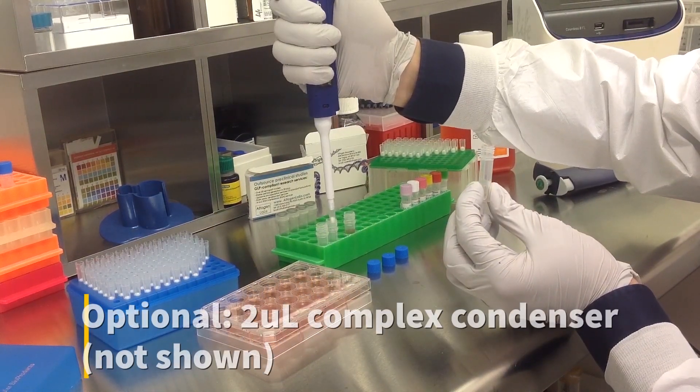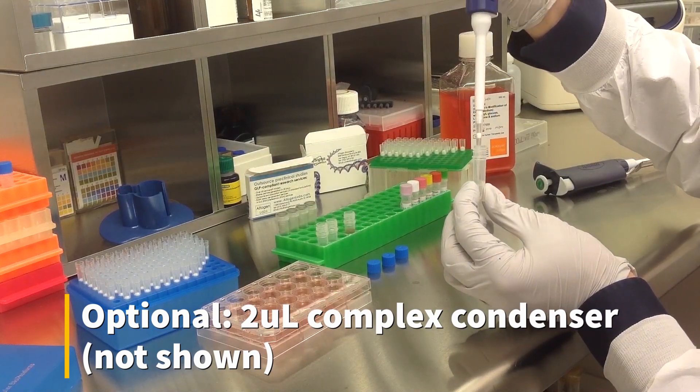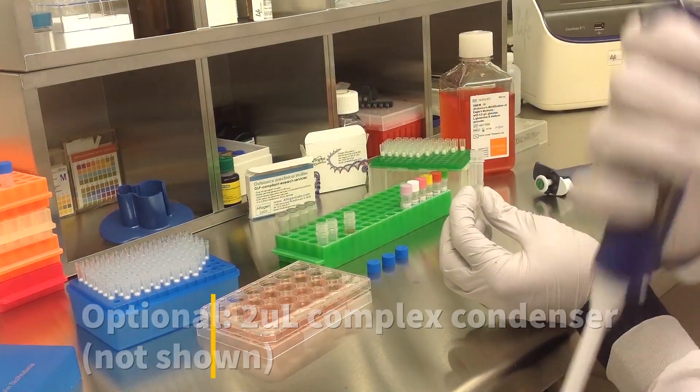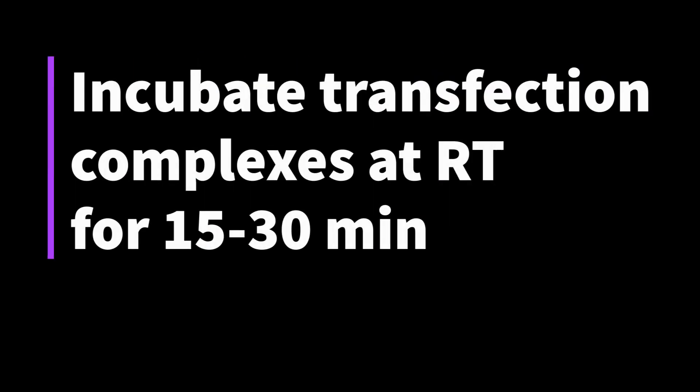An optional step is to add 2 microliters of complex condenser, which increases transfection efficiency but may also increase cytotoxicity. Incubate the prepared transfection complexes at room temperature for 15 to 30 minutes.